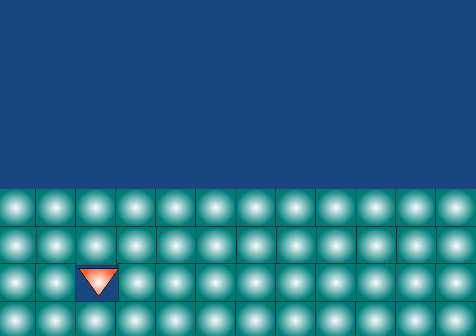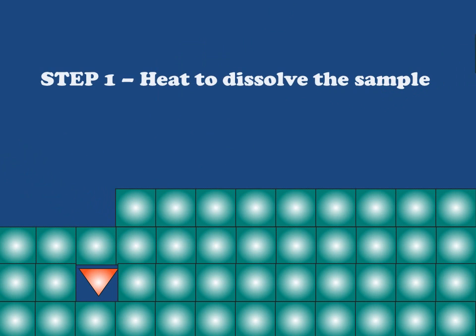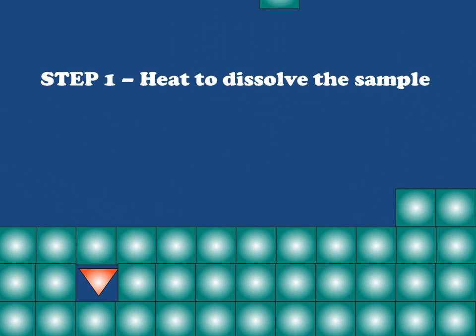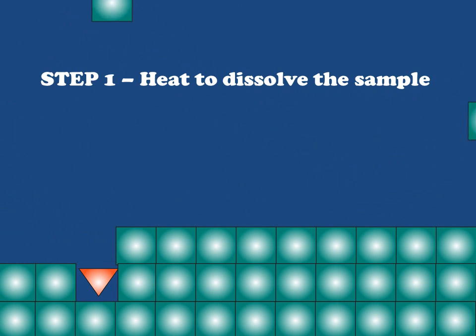The first step in any recrystallization experiment or procedure is to disassemble the crystal by dissolving it. At the molecular level, we've got to take this whole thing down. We do this by placing the crystal under solvent and then warming it until it dissolves. So let's go ahead and dissolve this, disassembling it at the molecular level.